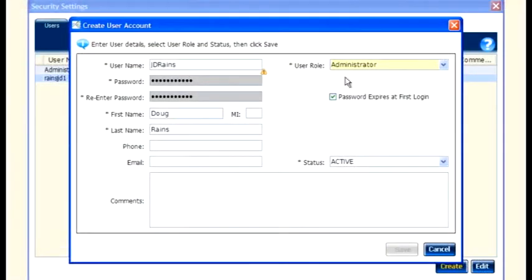If we were creating someone else's account, then we'd want to leave this box checked. That way, once the person logged in, he or she could change passwords. But since this is my account and I like the password I entered already, I'll uncheck it. We as administrators also have the ability to suspend or inactivate users. Now, my Save button doesn't show up and I have a little yellow flag here. Okay, so it's telling me that I need a username of at least 8 characters, so I'll just add a 1 to the end. Now, I'll save.